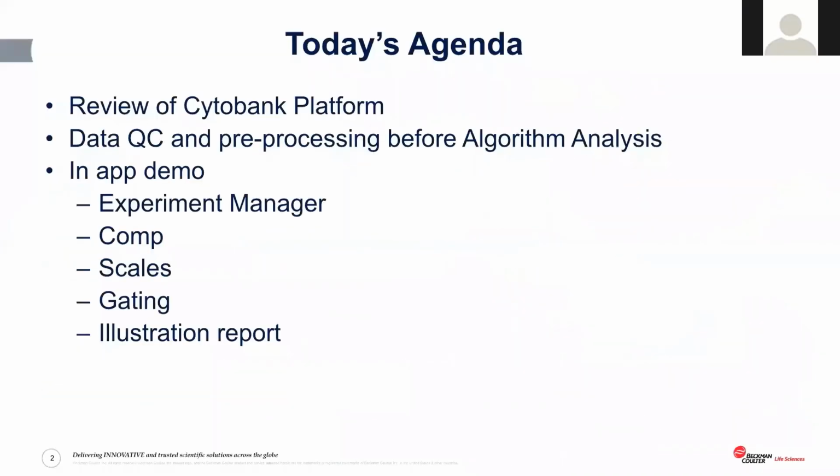What I would like to do here is to give a short overview of our last sessions of Cytobank intro first. I know most of you have attended some sessions on Monday. For those just joined, they can catch up this way.